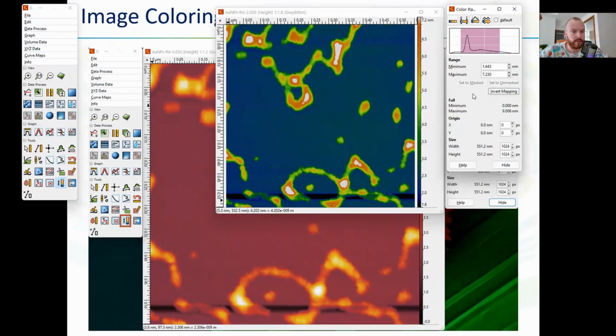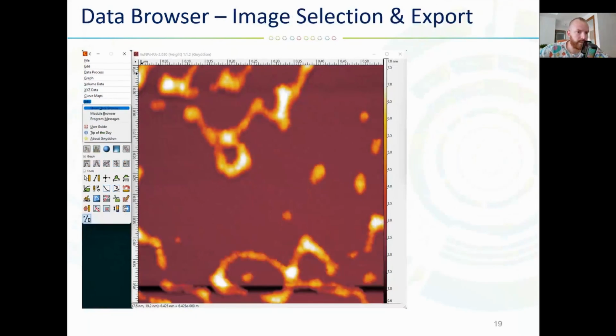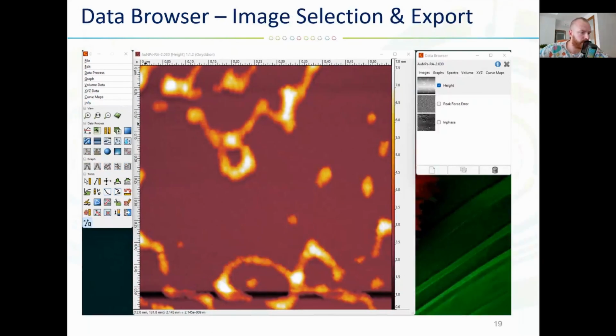Try to get into every button, at least here on the panel, just to get an idea what these buttons are doing with your data and imaging. I think, yes, I explained all this stuff. And then the last one, I think, is export.